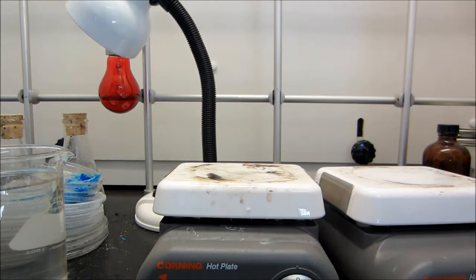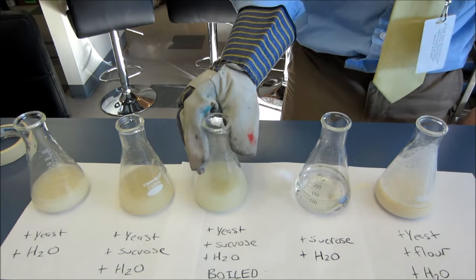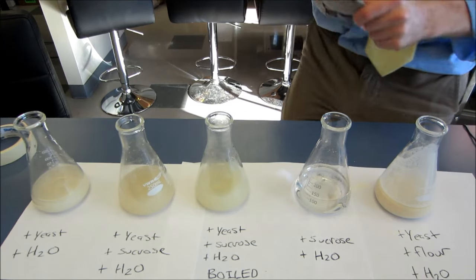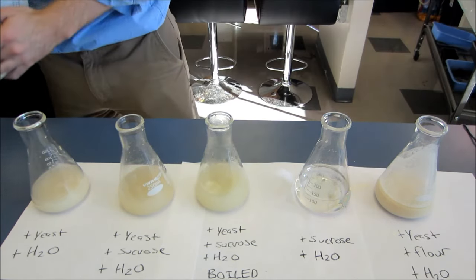You can see it's nice and boiled there. I'm going to take it. Let's add it back to the others. We are ready to begin this experiment. Everything's been added.